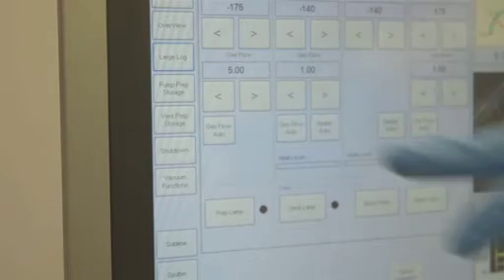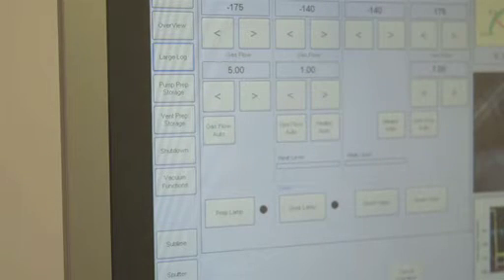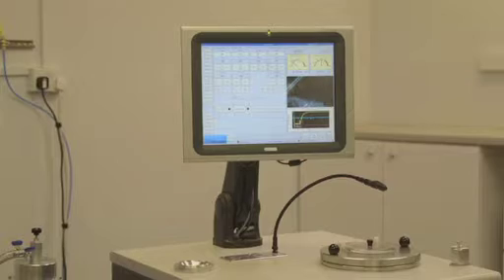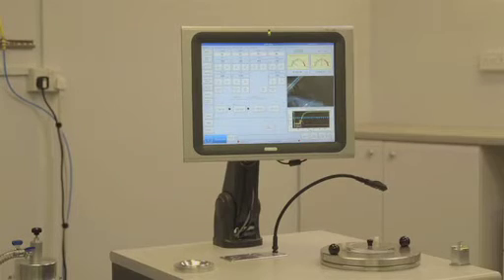All processes are controlled and monitored from a large touchscreen PC mounted above the prep deck work surface.